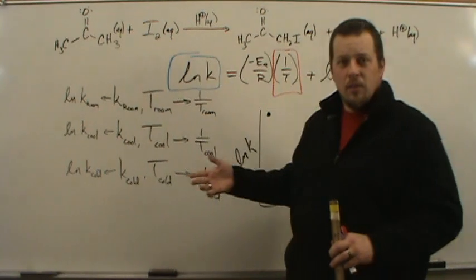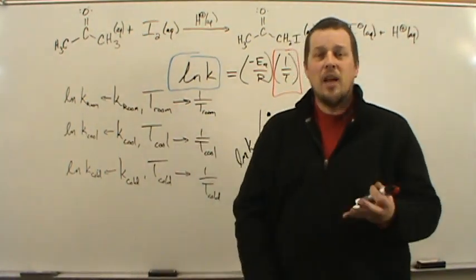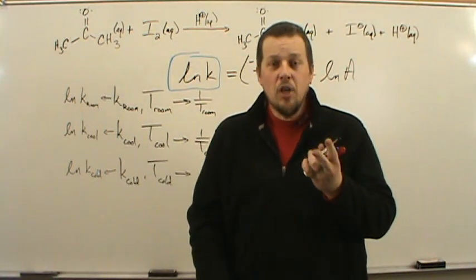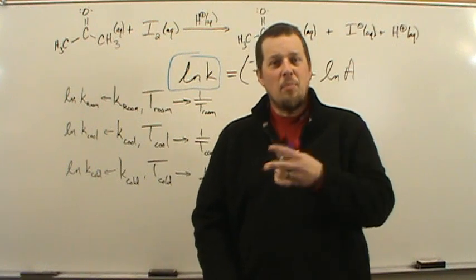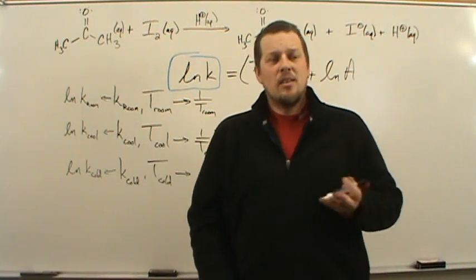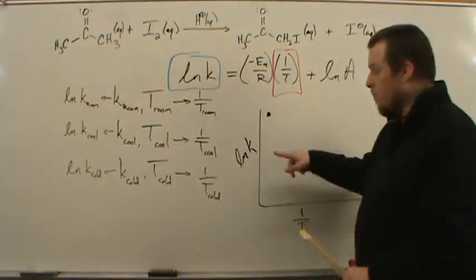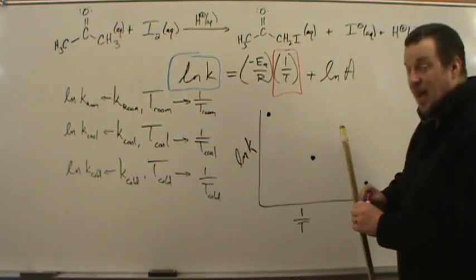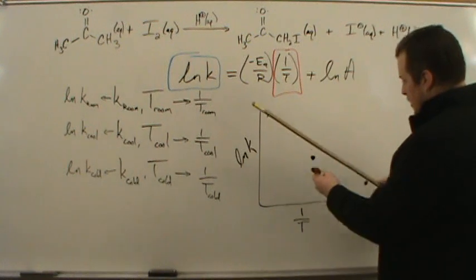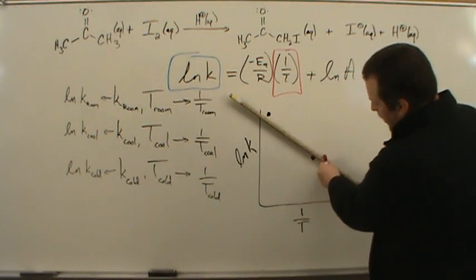When I'm using the comparative form of the Arrhenius equation, I'm really relying on both of my data points to be really good, to be really correct. If they both have a little bit of error, if they both have a little bit of variation in them, that's not a good assumption. With the linear form, when I plot my 3 points, I can fit a line to those 3 points, and by fitting that line, you see these 3 points really aren't very linear.